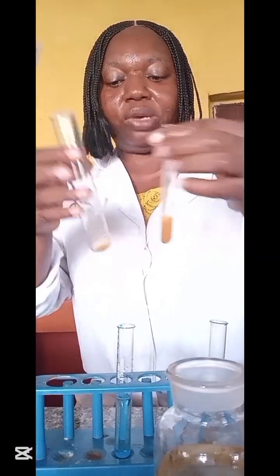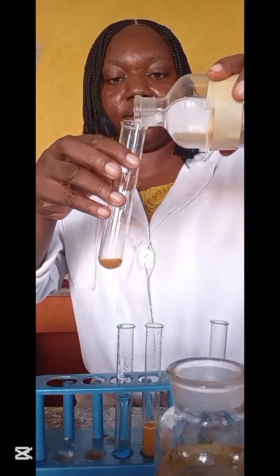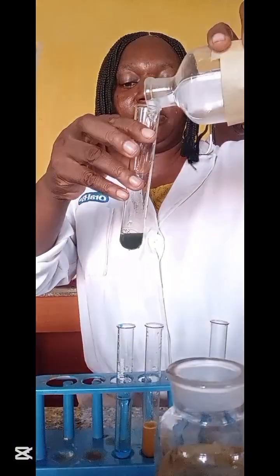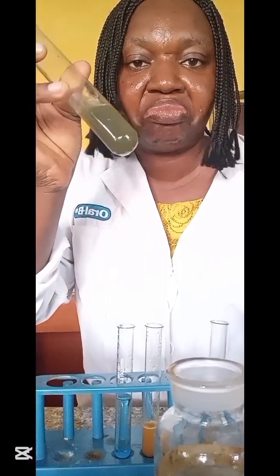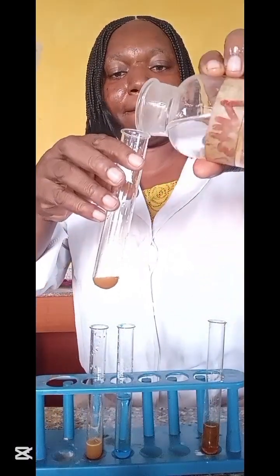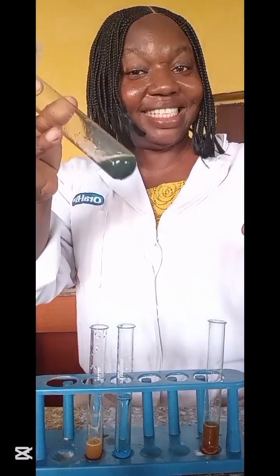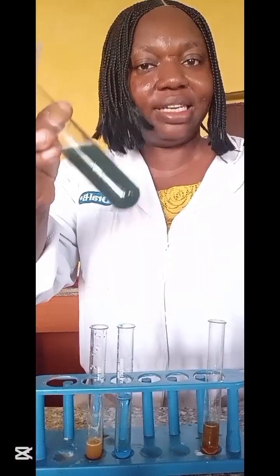So this solution is supposed to be iron 2, and if it's iron 2, it's supposed to give us in sodium hydroxide a dirty green, like army green. They call it a dirty green gelatinous precipitate. In excess sodium hydroxide, it does not dissolve. Let's try it with ammonia. A dirty green gelatinous precipitate, insoluble in excess.